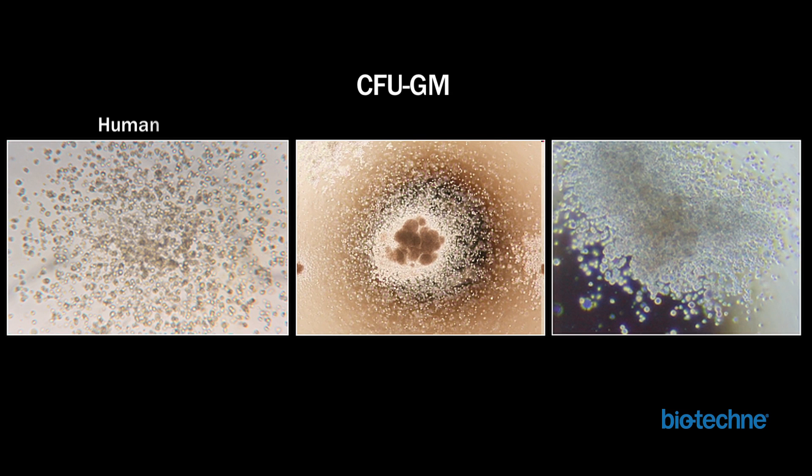CFU-GM colonies, which consist of both macrophages and granulocytes, have a composition of CFU-G and CFU-M morphologies. Human and mouse CFU-GM colonies typically have a compact center of smaller granulocyte colonies and a loosely packed periphery containing large macrophage cells. To accurately identify these colonies, it is important to view the cell cluster across multiple focal planes. CFU-GM colonies can be easily mistaken for CFU-M or CFU-G colonies when viewed in a single focal plane, which may make the small cells in the compact center appear large like macrophage cells, or larger macrophages appear like smaller granulocytes.